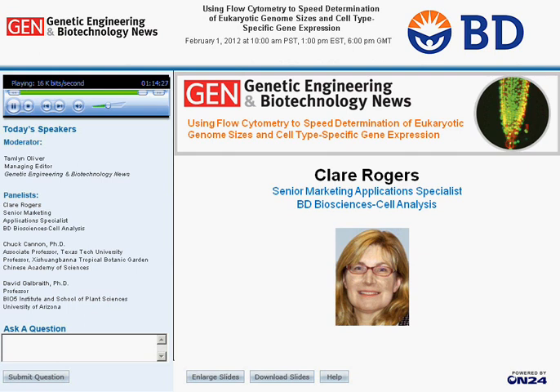All right, Claire, I have a multi-part question for you. I'm working with protoplasts that range from 20 to 60 microns in diameter. What is the practical limitation of size for use with the Accuri C6 cytometer? Are large diameter flow cells available for this instrument? The size of the flow cell is 200 microns in diameter. With the adjustable fluidics, you can adjust the core of the fluid stream to 100 microns.